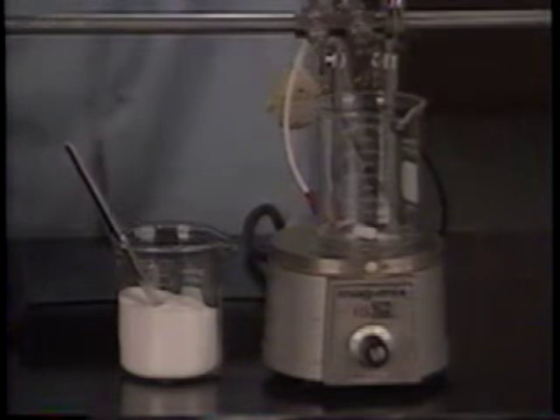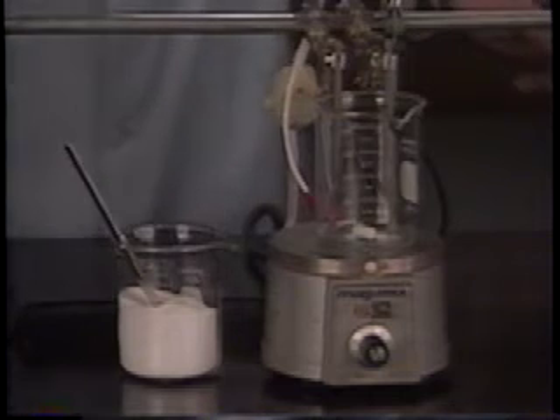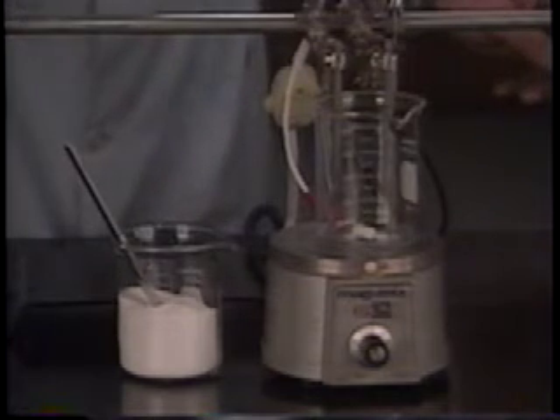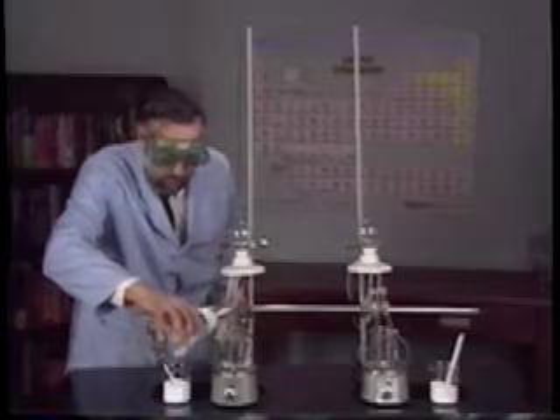I have two beakers here, each with a pair of electrodes in them. The electrodes are nice and clean. I'm going to put in some distilled water — pure water — into this one, and water into this one.